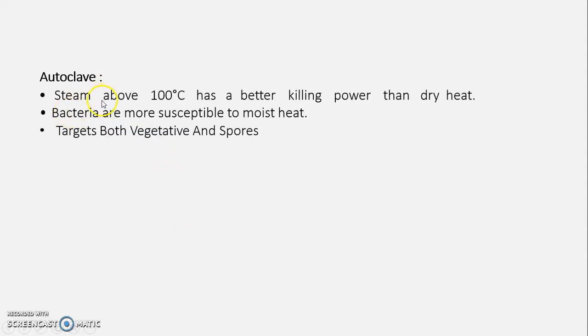Then under the category of moist sterilization, the autoclave. Autoclave uses steam above 100 degrees Celsius and has a better killing power than dry heat. Bacteria are more susceptible to moisture.